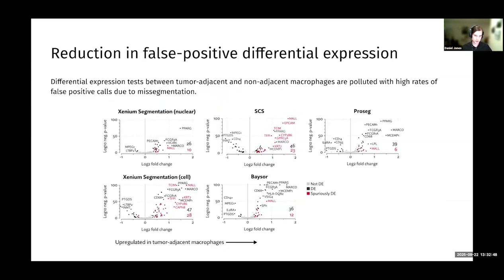But this is a good opportunity to look at the basic analysis that we might want to do, which is compare macrophages that infiltrated the tumor to more distal macrophages.